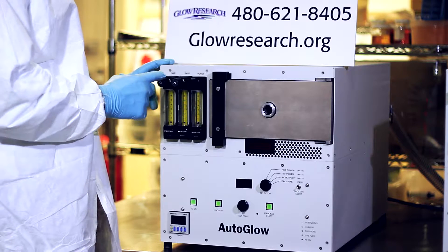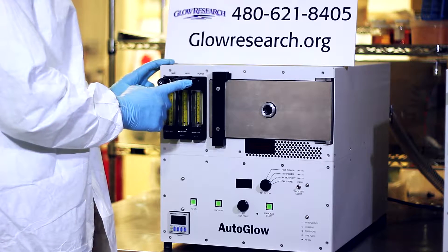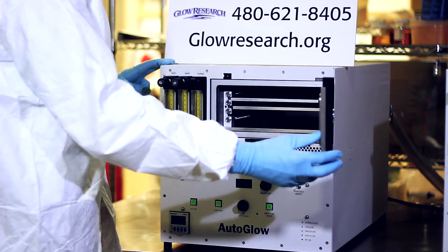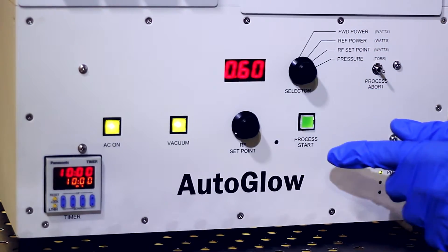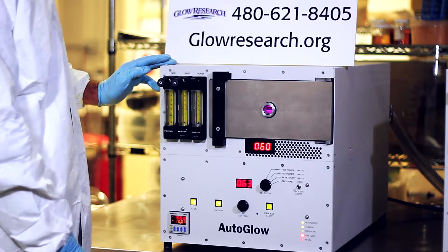The system is designed for gases such as oxygen and argon, as well as fluorine based gases. The system can be run in the RIE mode for etching using gases such as CF4. RF power and gas flow will automatically activate as the chamber pressure is reduced below 0.5 torr, the crossover pressure.